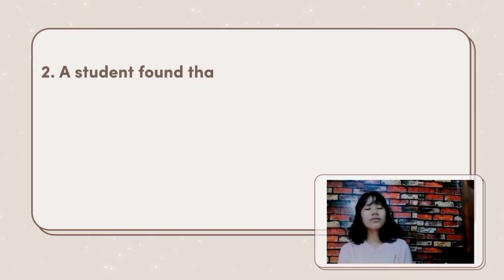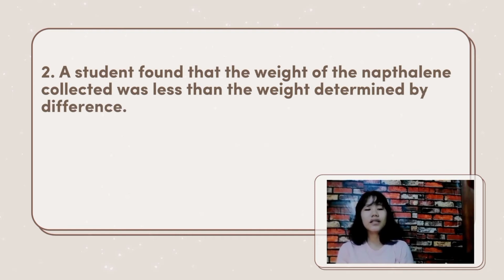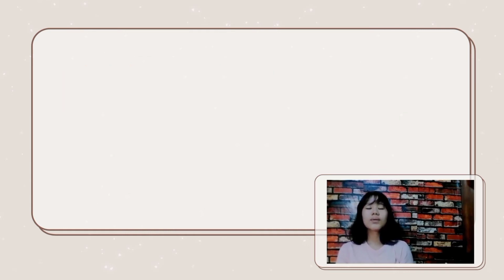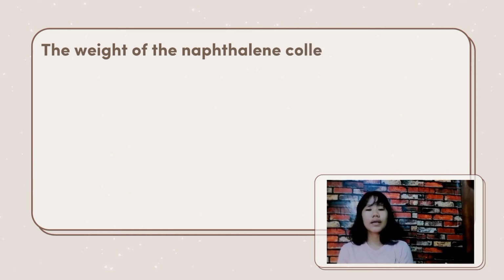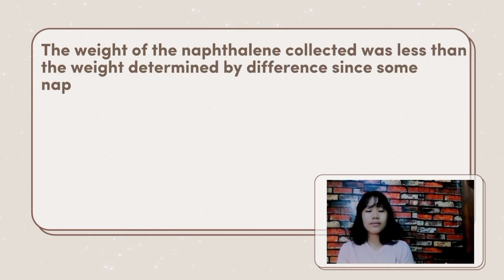Number 2. A student found the weight of naphthalene collected was less than the weight determined by difference. What would account for the smaller amount of naphthalene collected?